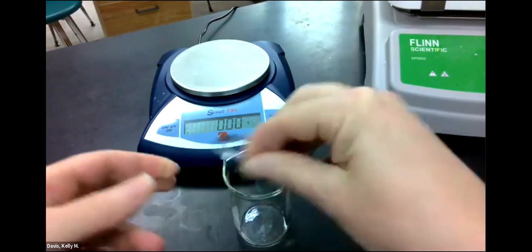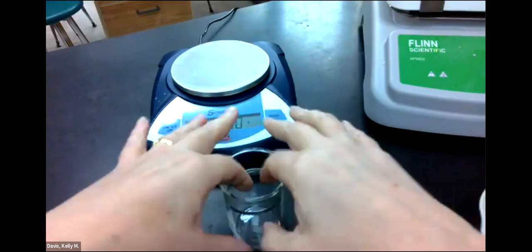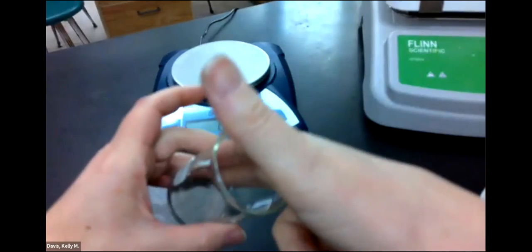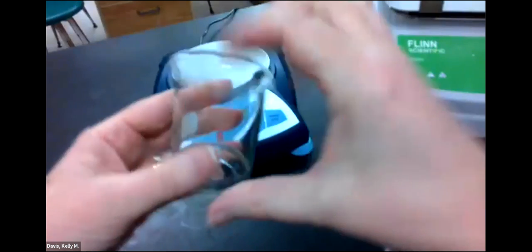I want to add as little acid as possible. Let's see, I don't know if that's going to work. I'll just set it in there. Okay, good enough.